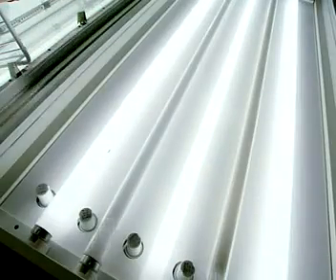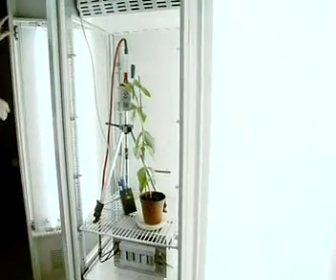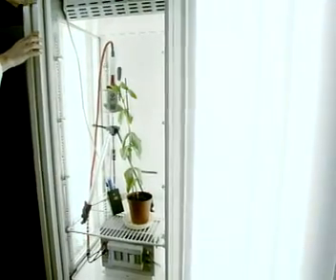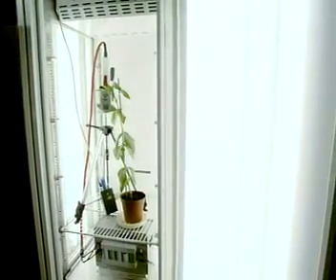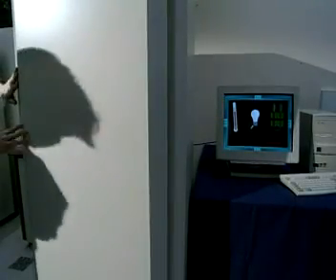Light intensity is controlled by switching on a different number of fluorescent tubes in the cabinet. Close the doors and the gas analyzer does the rest.